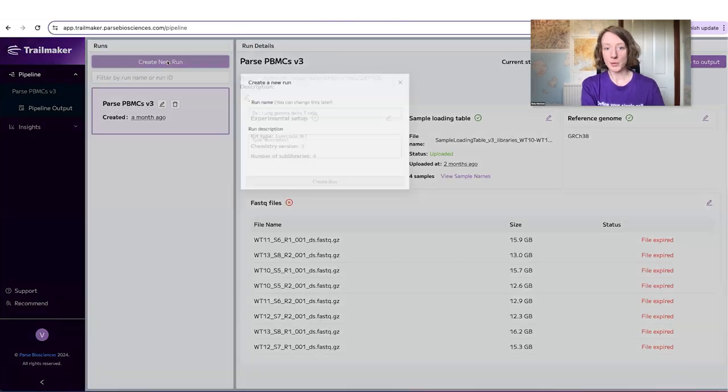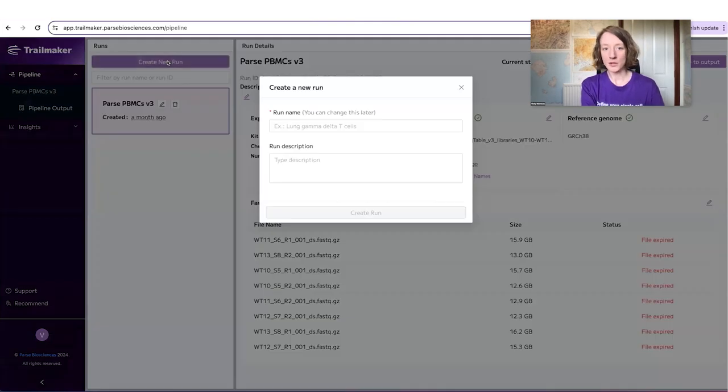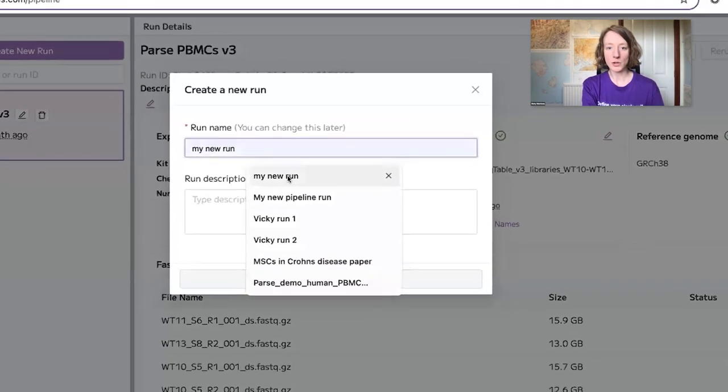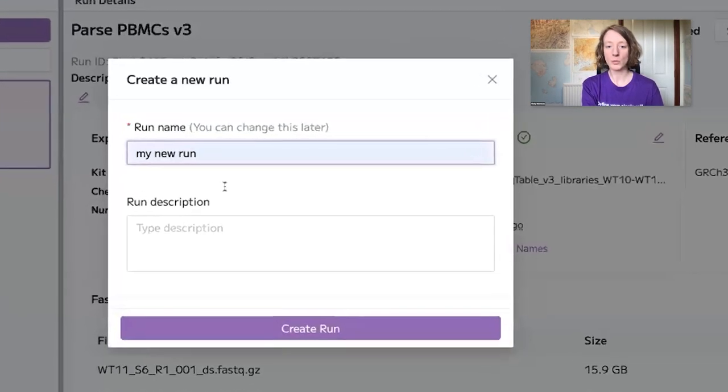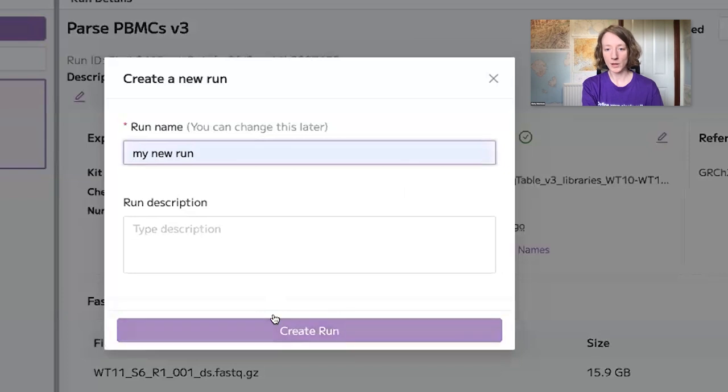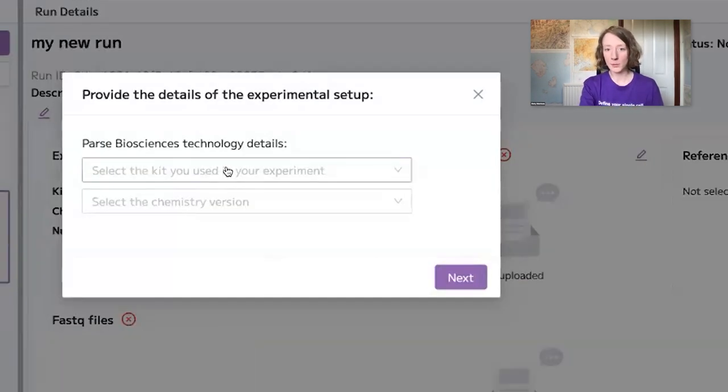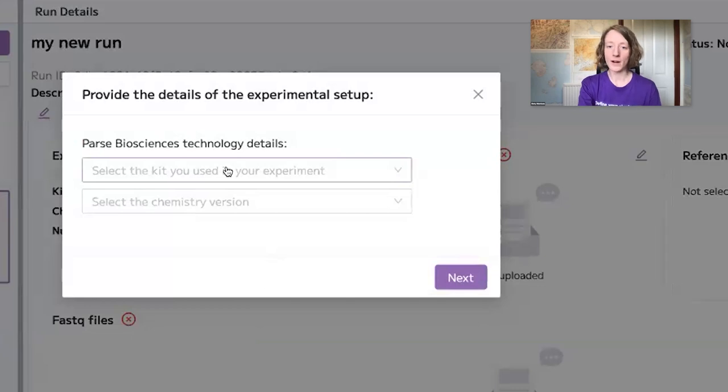It's very simple to process your FASTQ files within TrailMaker. First, you create a new pipeline run within the platform, and then a wizard walks you through each step where you input the experimental details that are required.